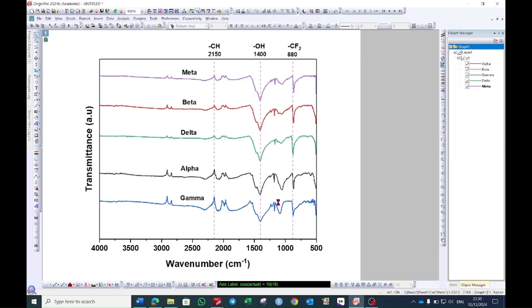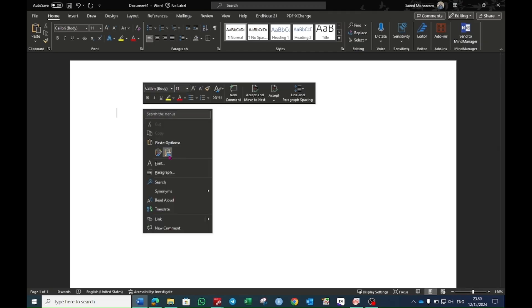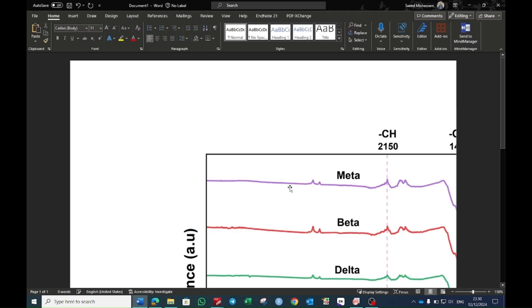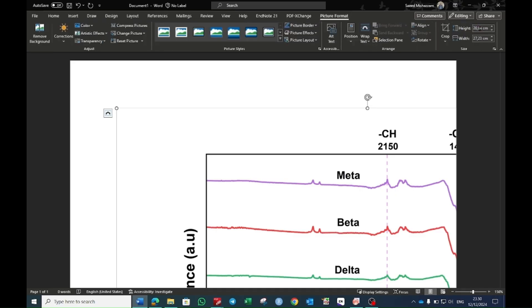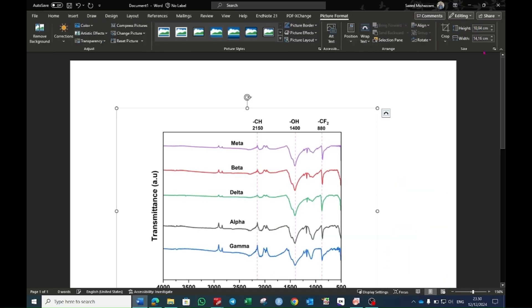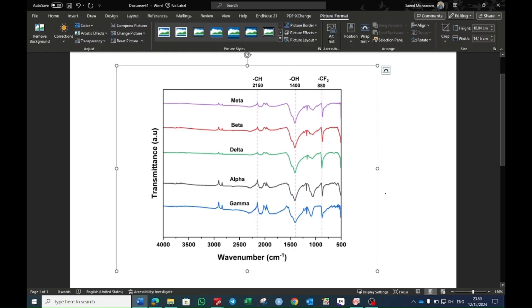It will copy the graph in the form of image and when it's done go to the word file and here you can paste it in the form of image. Then you can go to the picture format and here you can change the size to 10 and it will plot the graph.